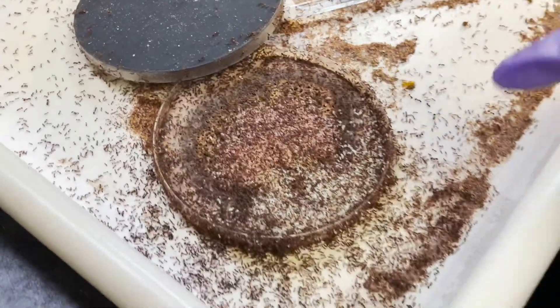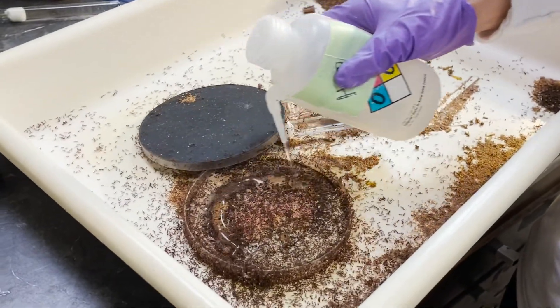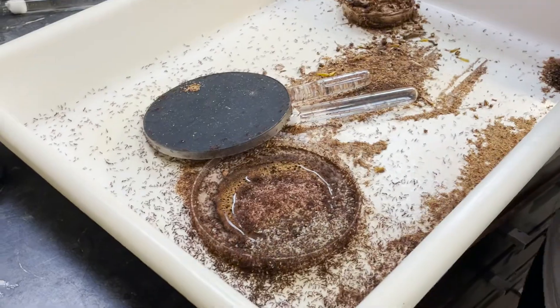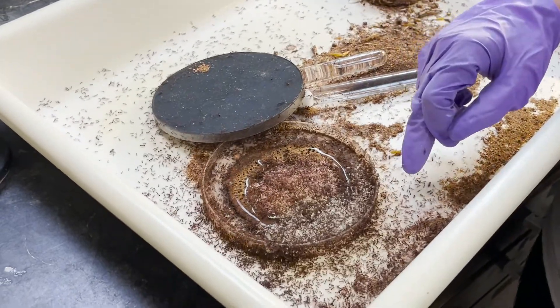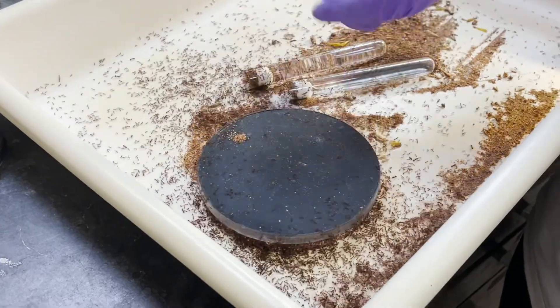This is how we water them. We simply put water directly on the nest, just like that. You don't need to give them too much so it doesn't run out. If it leaks out a little bit, that's fine. Then we just close it back up.